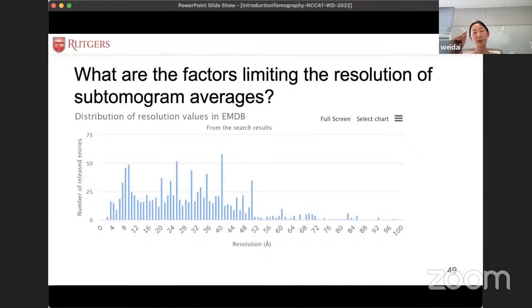Think about this. Any step you process along the way, there are potentials for errors and imperfection. For example, I can't get a 100% perfect alignment, right? So basically, I might have some errors inherited from data alignment to start with. And then from back projection, there are definitely some errors generated and passed along to the 3D map.